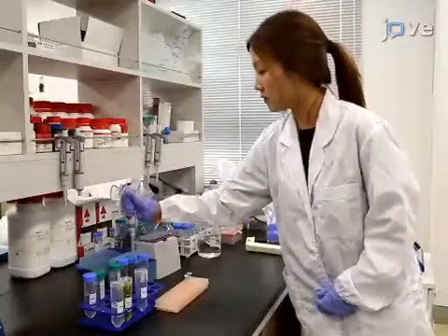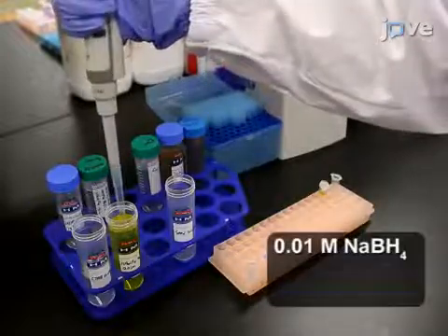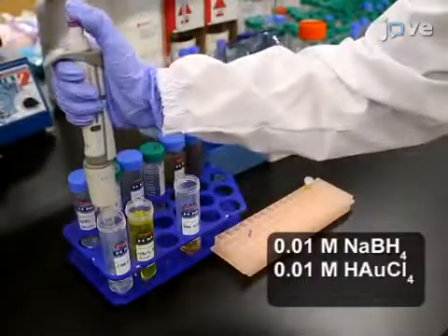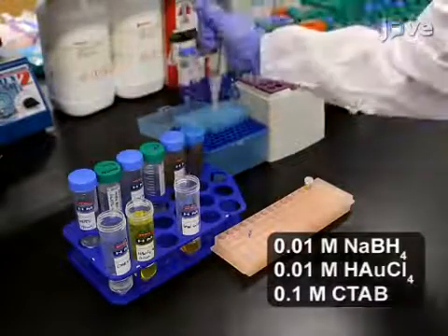To prepare gold nanorods, first formulate the seed solution by adding a freshly prepared 0.6 milliliter ice-cold solution of sodium borohydride into an aqueous mixture of 0.25 milliliters of chloro-aureic acid and 9.75 milliliters of CETL-trimethylammonium bromide.